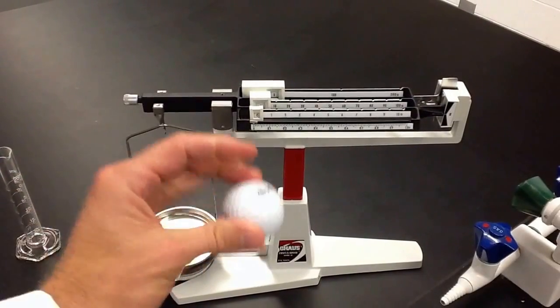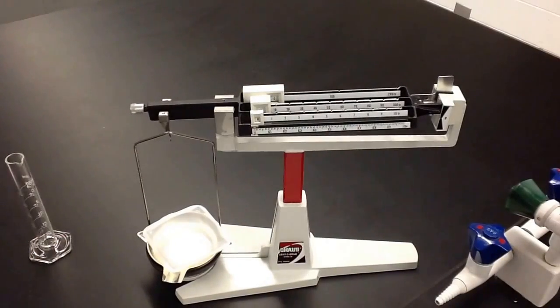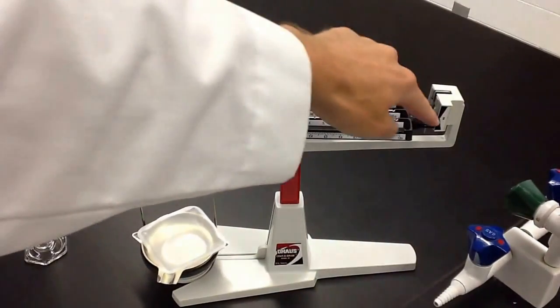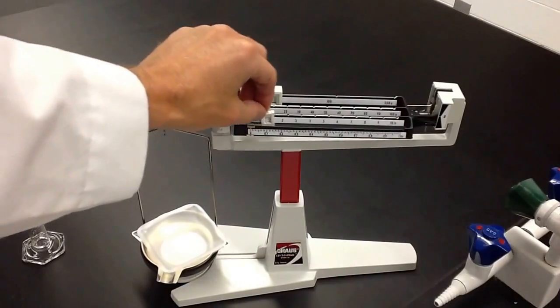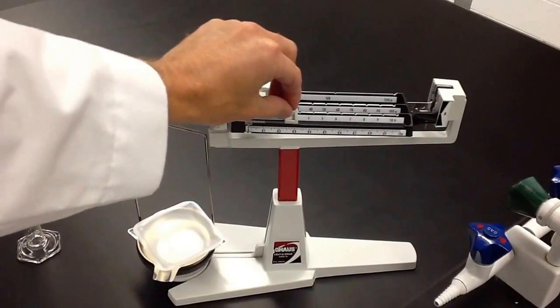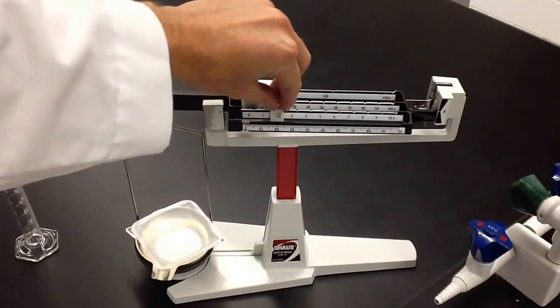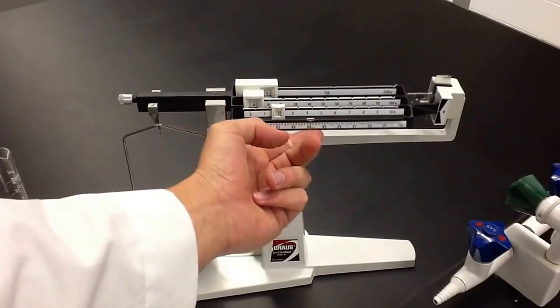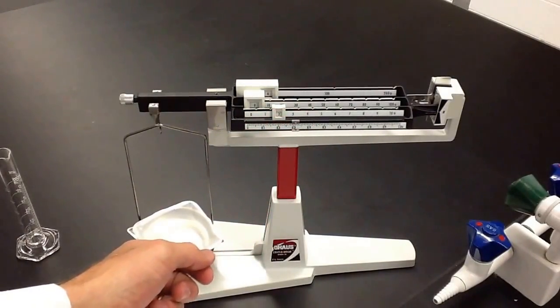So the first thing we want to do — if I want to find the mass of this golf ball, I would put my tare on here and find the mass of that. To find the mass of the tare, we start always with the biggest bar. That went down too far, so we go back to zero, then move to ten — too far again. I move this into the notches each time. When I go to three it's too far, so I go back to two, put it in that notch, and then slide this one over until I get it to zero out. And that's pretty good.